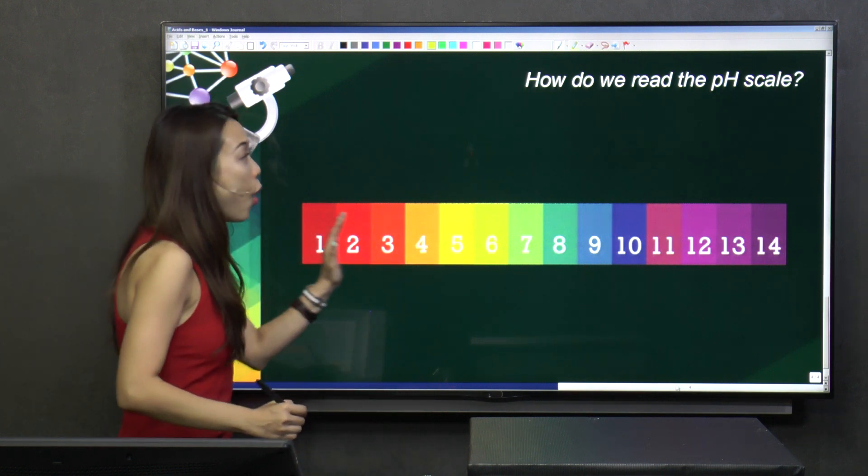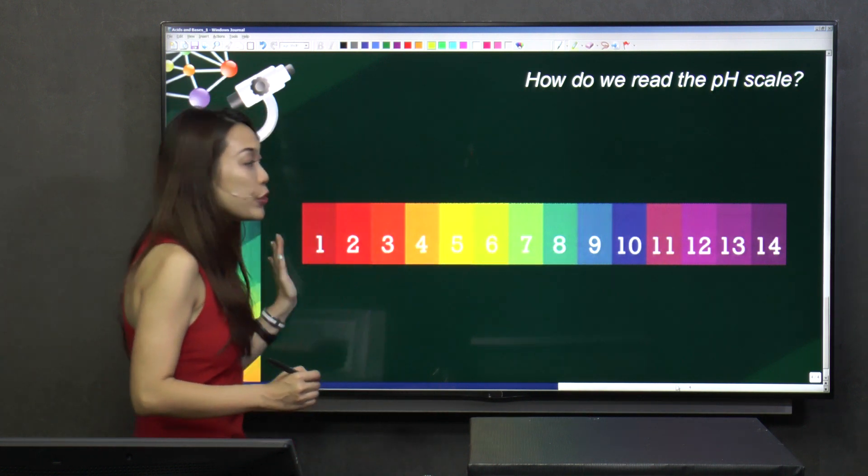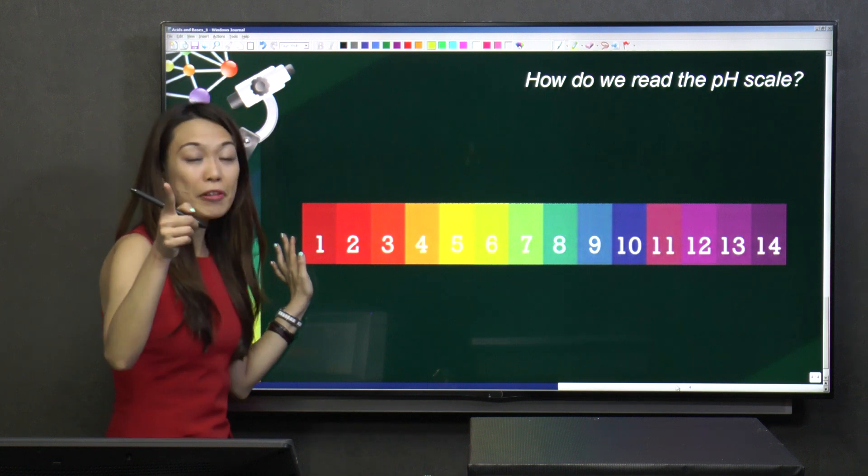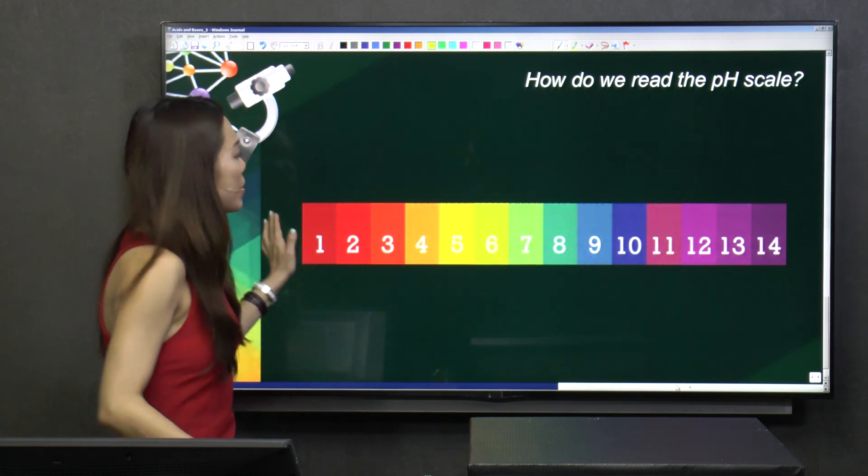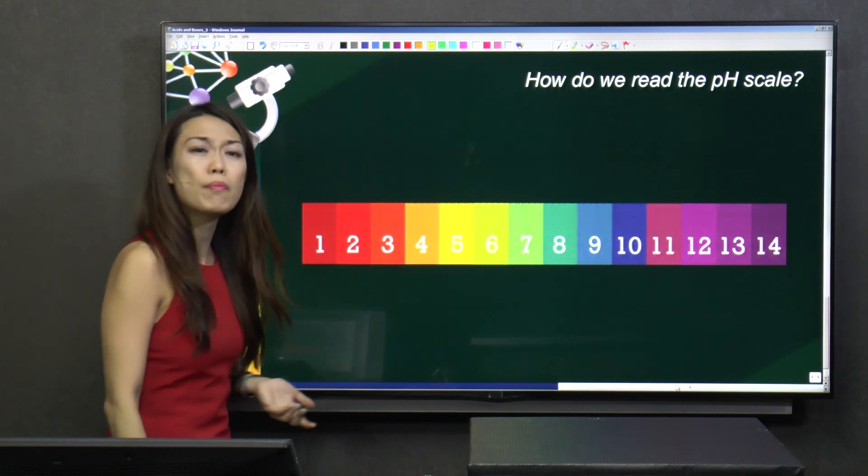This is the whole range of colour for Universal Indicator. Well, now your question will be, Miss Celina, so much colour, how to remember?